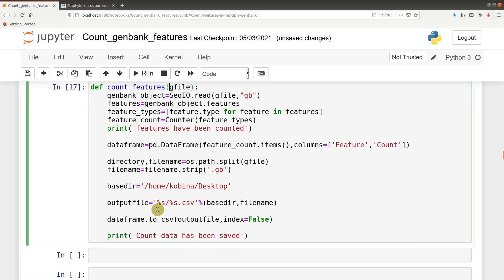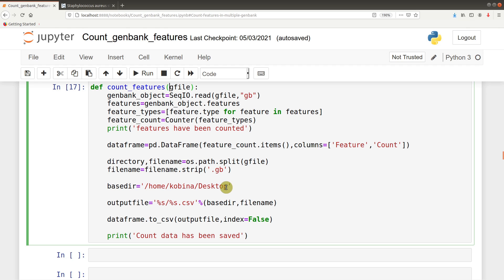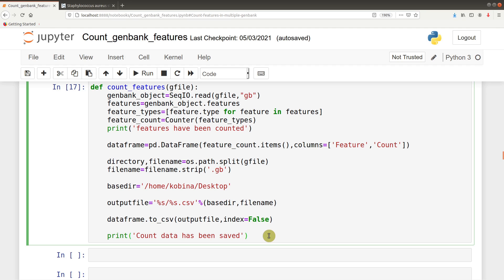Then the file is saved to a directory. We set this base directory — this is where all the files will be saved, on the desktop. Because we have different files, their respective names will be used to save them. Features are counted, placed in a DataFrame by pandas, and then saved to an output file. That is what this function is doing. Full explanation of this code is found in the previous video, and you can watch that as well. So now we run this function.